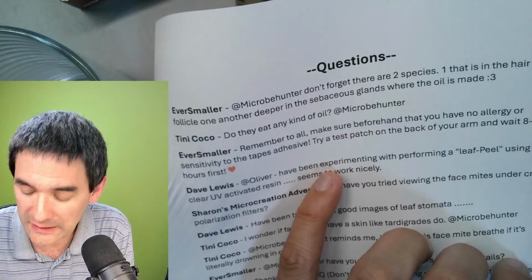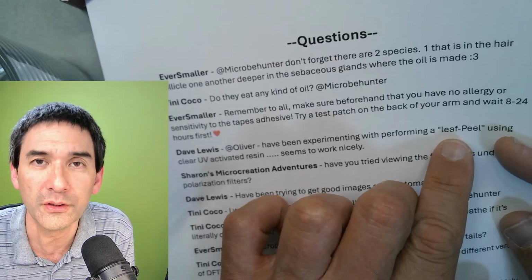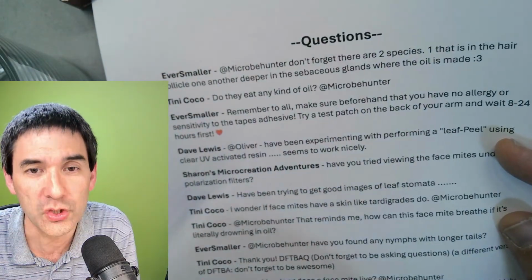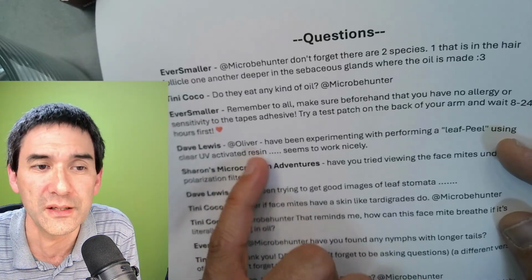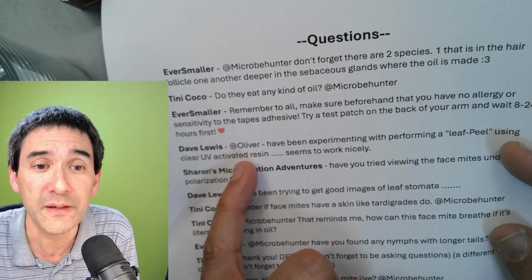Yeah, so the leaf peel, that's a little bit off topic. But it works like this: you apply a little bit of glue on the bottom side of a leaf, and then when you peel it off, you can actually see the surface texture of the leaf, and sometimes also the stomates and the shape of the cells. So you're making a leaf imprint.